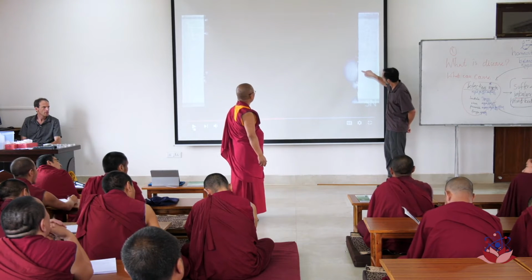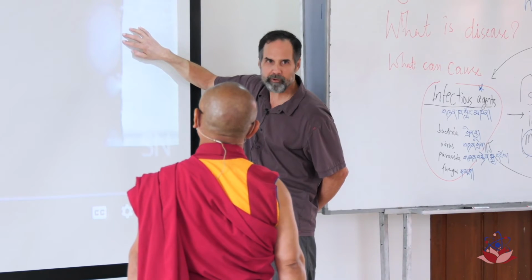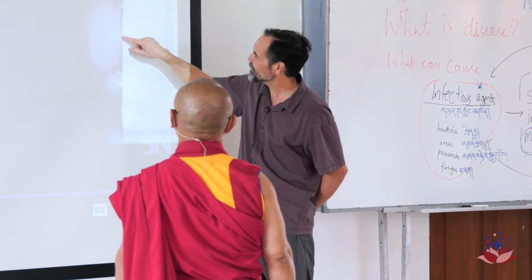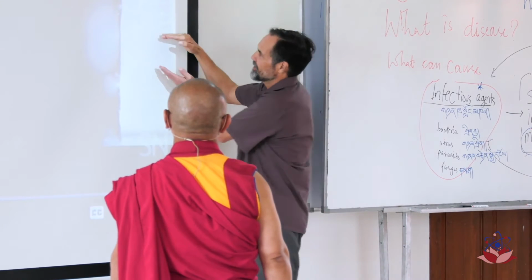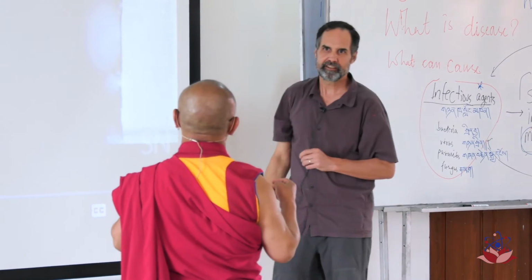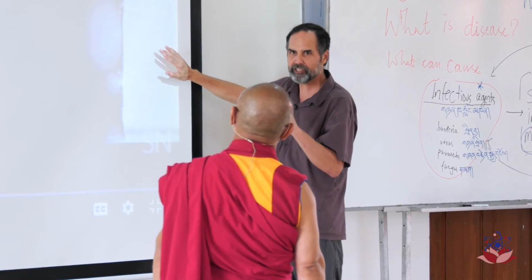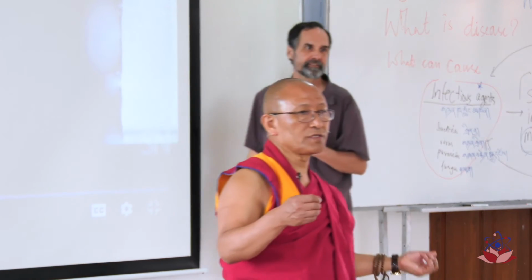Could be that here a mutation happened and it grew out and some of the descendants of that one hit here and this one grew and took over the field. It could have happened back here, but it didn't happen very far away because then everybody would have just grown immediately. He's saying variation. So you're saying that variation could not have happened? Variation is happening everywhere, but the mutation that allows this to grow had to happen very close to the spot.